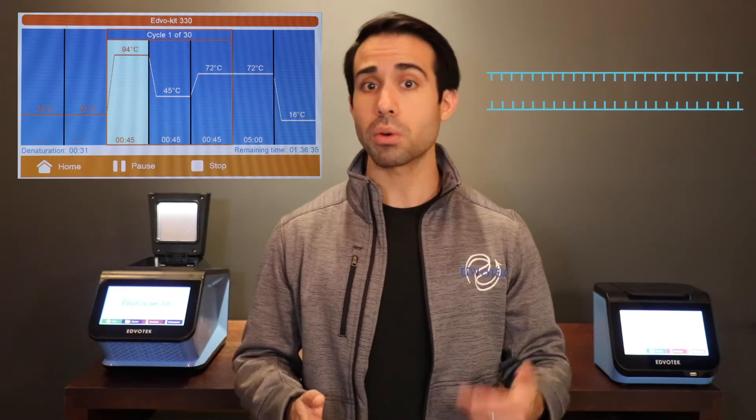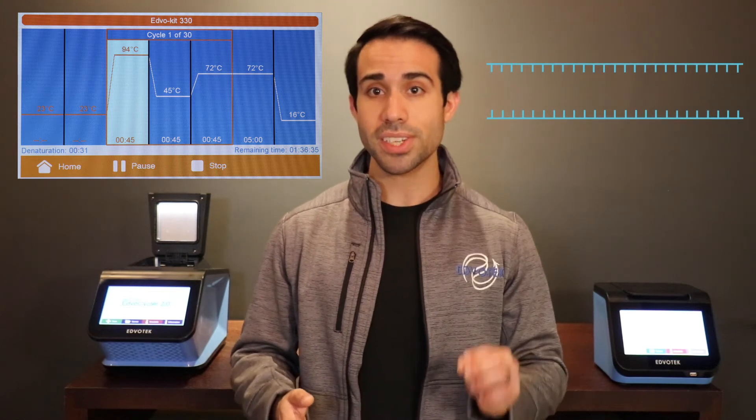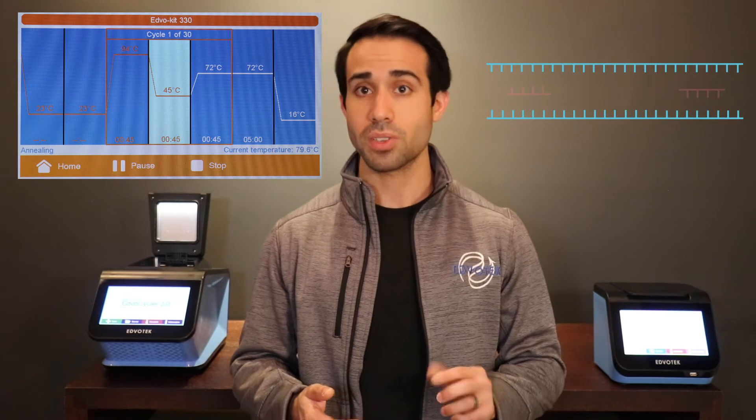Once your sample has been fully prepared, it can then be subjected to repeated cycles of heating and cooling to allow new DNA strands to be synthesized. The basic steps of a PCR cycle can be summed up like this. Step one: denaturation, where the sample is heated at a high temperature to separate or denature the DNA strands themselves. This results in a single-stranded DNA template needed for the next step.